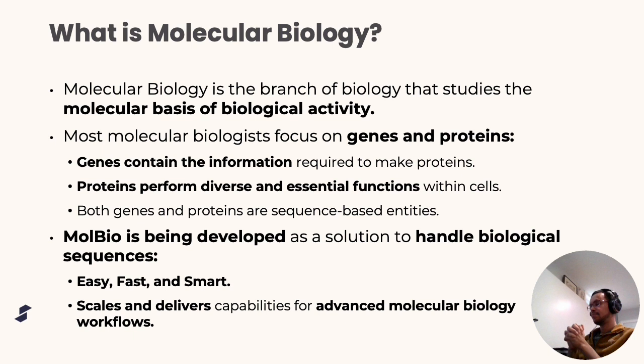And of course, we want the software to be smart. What we mean by that over here is that there is biointelligence built into the software, so it's able to notify you and alert you based on the workflows and based on different errors that you may encounter. At the same time, Molbio is also being built from the ground up in a way that it allows us to scale and deliver capabilities for advanced molecular biology workflows. The field of molecular biology has come a long way in the last 50, 60 years, and we hope to be able to accommodate these complex workflows in the future.